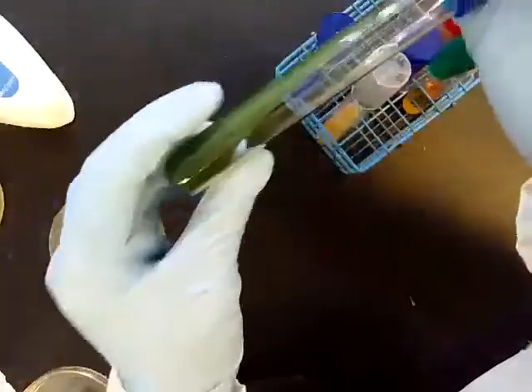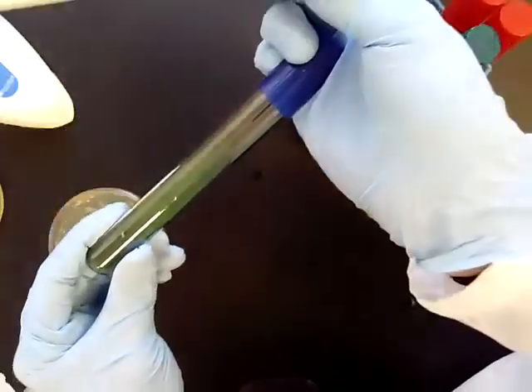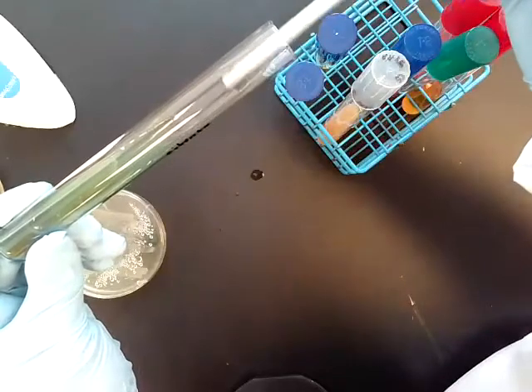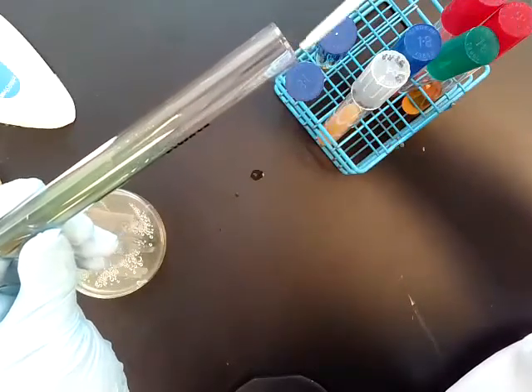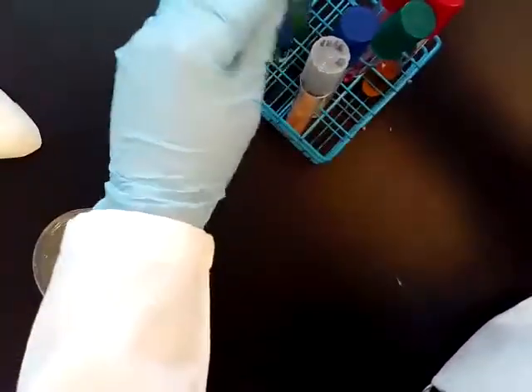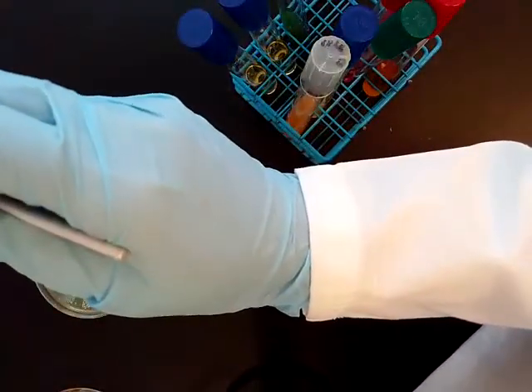To inoculate the slant, we're going to do this on the side. Again, we're just going to paint up the surface of the slant. So we're going to put those tubes in the incubator, and then we'll come back and check those results once they're done growing.